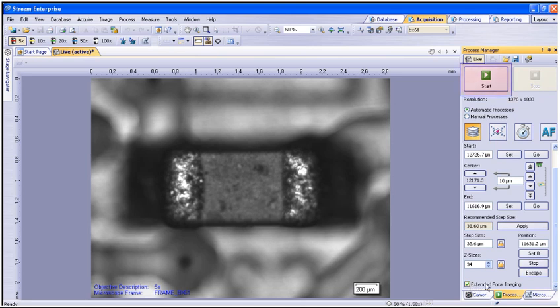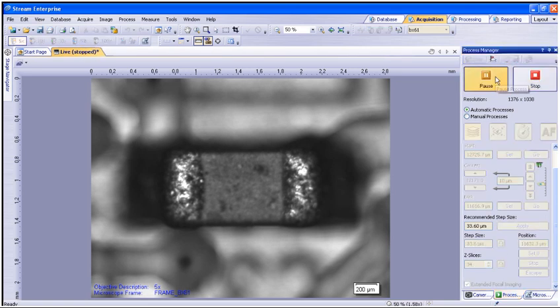Once the settings are complete, you will simply press the start button at the top. The process will now be automated and perform all of the image captures required to generate the all-in-focus image or EFI.